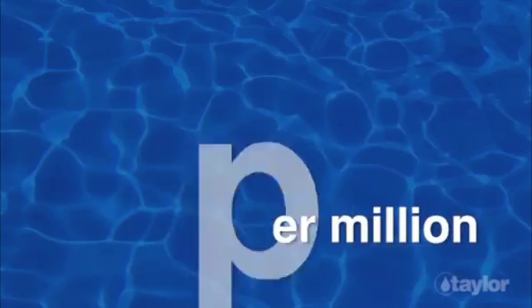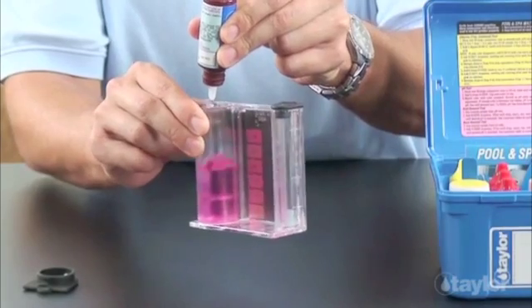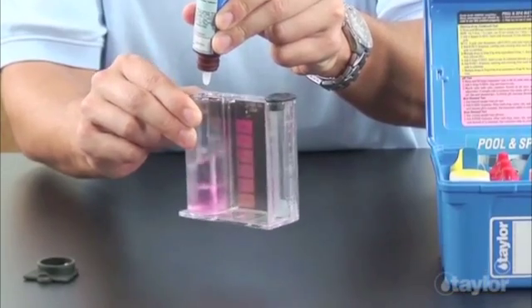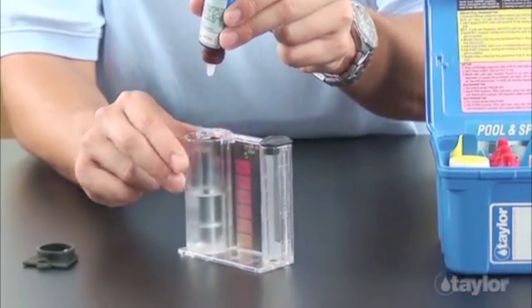Eliminate color-matching pinks. Calculations of treatment doses are more accurate — no under or overdosing. Very high levels of sanitizer that would be off-scale on a color comparator are easy to determine by counting drops.